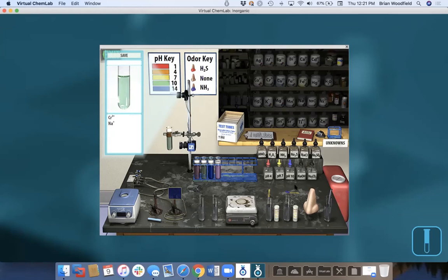All right, how do you do unknowns? There are several options you have here. In older versions in the 2000s, we had a back-end system that allowed you to customize your unknowns, but nobody ever used it, and it took half of our resources to manage it. And so we kind of did away with it. But we have options for unknowns here.